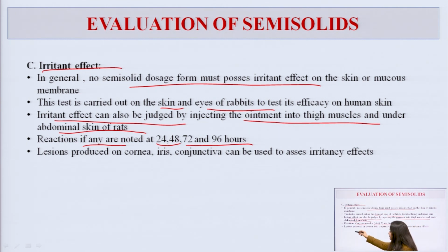formulation, or the presence of any lesions on the cornea, iris, or conjunctiva, which can help us to analyze the presence of any sort of irritancy effect produced by any of our ointments. So, these were some of the tests which were used to evaluate the ointment.